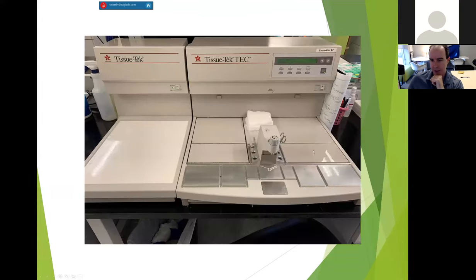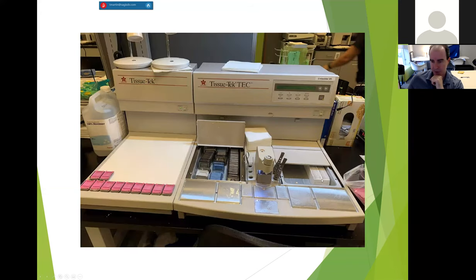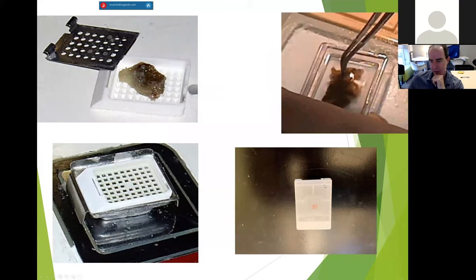So we take our cassettes out of these holes right here, which you can see have all the wax embedded tissue. We take them out, we open them up. We literally pour wax on the top of them in these little metal containers right here and let it cool and harden on this cold plate. So it's hot right here so we can orient it and get it just right, and then we get it cold so that it hardens. And this is kind of a schematic. And what you end up with is this right here: the tissue embedded in the paraffin.